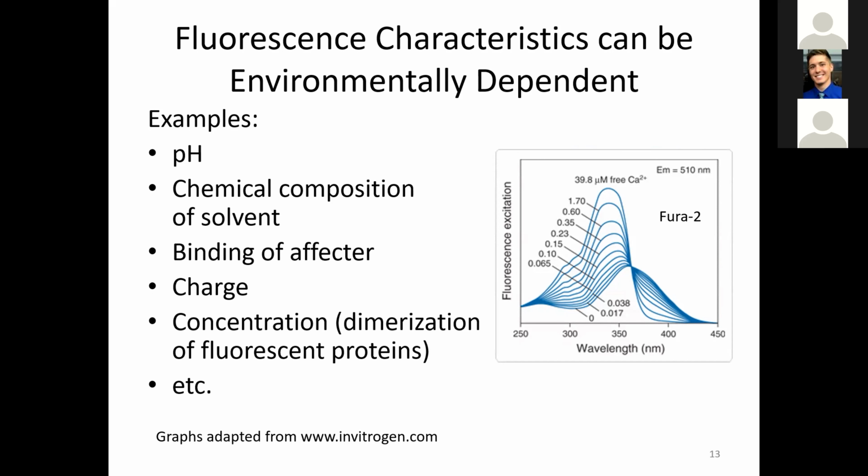One of the things that I think is overlooked is the concentration. It is possible to over-concentrate fluorophore in your sample. There are situations where an overabundance of fluorophore will actually quench instead of being brighter.